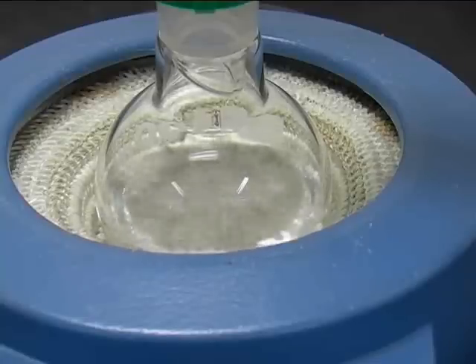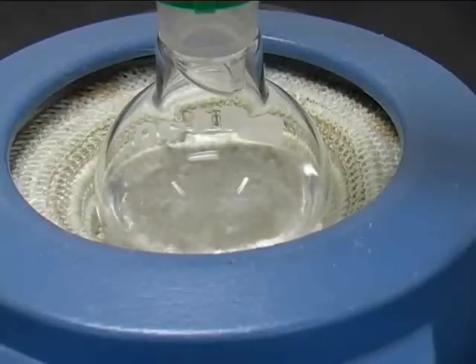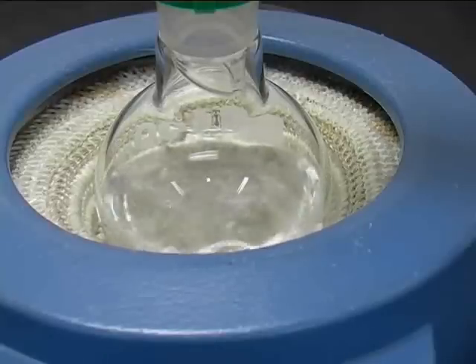That's all. That's it to refluxing. It is a quite important technique that is often used, so please try to remember it.